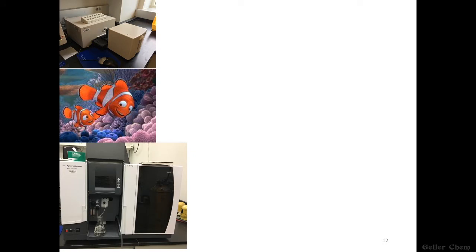Okay, I'm going to start this video by showing you what some of the instruments we're going to be learning about look like. This little guy here is called a UV-Vis spectrophotometer. We'll learn about that one first, and then we'll eventually learn about its larger cousin, the atomic spectrometer. What we won't learn about is just how crazy these spectrometers can get.